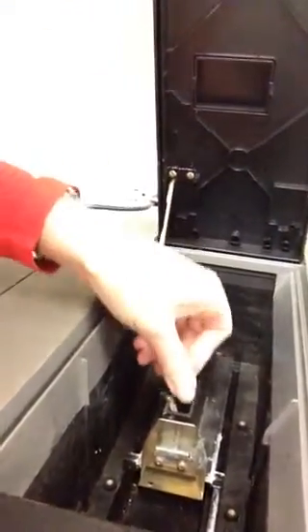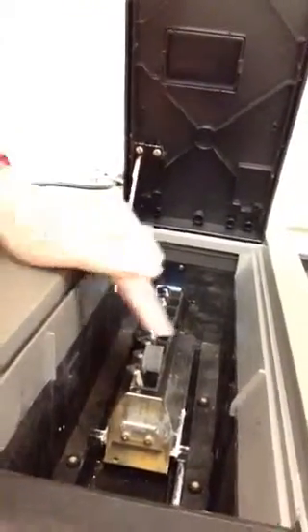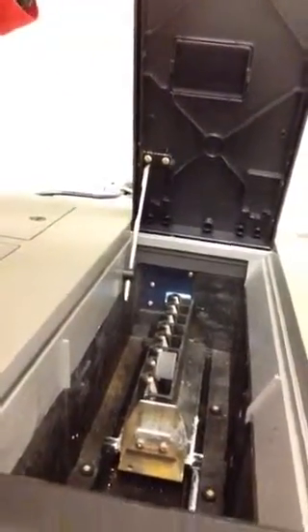We're going to put it into the sample chamber. And so here's the sample chamber right here. And we stick it so that the transparent sides are side to side. And what happens is the light passes through the sample from one side to the other, and then the instrument measures how much light is absorbed by the sample in comparison to a reference.